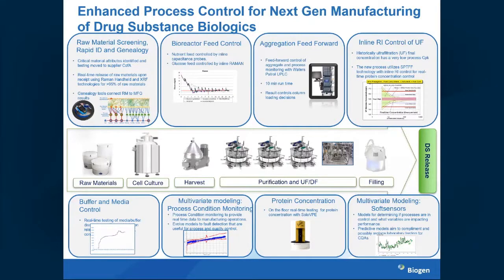And as I said, bioreactor feed control is the same thing. Many of our processes early on had been bolus feeds, where we have sort of fixed timing. And we're really moving all of that, and I know other companies are doing similar things as well, to feeding based on actually measuring and figuring out when the feeds should be. So it's almost like an adaptive thing. And the idea here is really getting a consistent product output, performance and quality output.